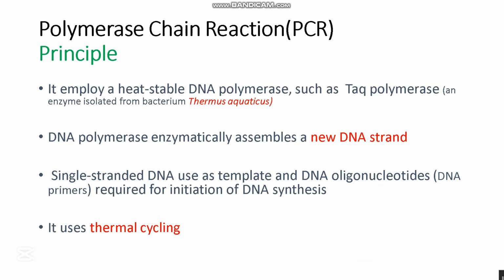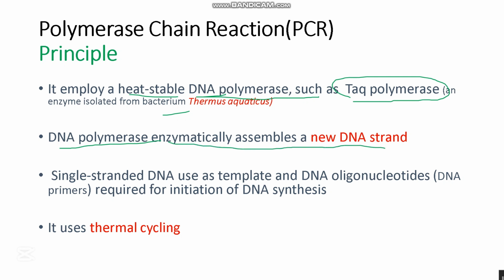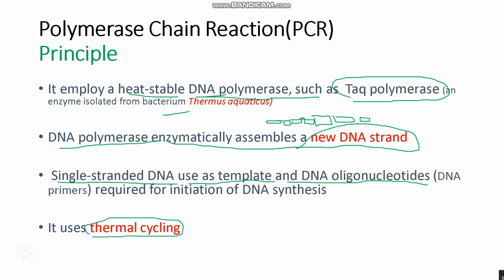Amazing. And it employs a heat-stable DNA polymerase, such as Taq polymerase. The DNA polymerase enzymatically assembles a new DNA strand, so the new DNA strand is formed. Single-stranded DNA is used as a template along with DNA oligonucleotides. It uses thermal cycling, like the thermocyclers.